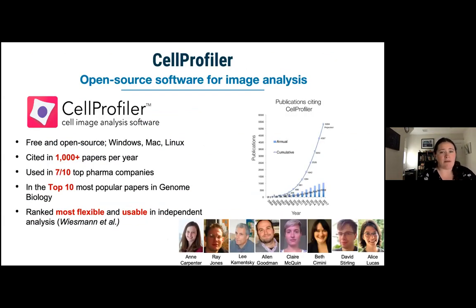The tool that our lab uses most of the time to do our high content analysis is CellProfiler, which was originally written by Anne Carpenter and Thouis Ray Jones. I mostly show this slide because I want to show the tremendous team of people who've been involved over the years in putting this together.